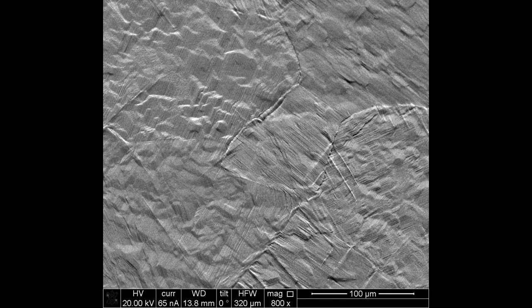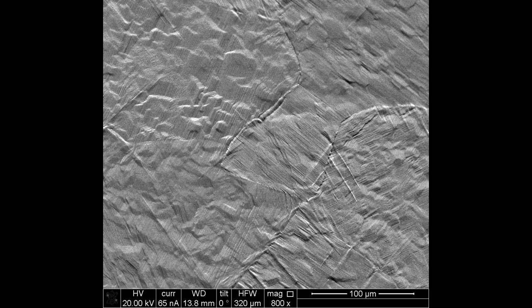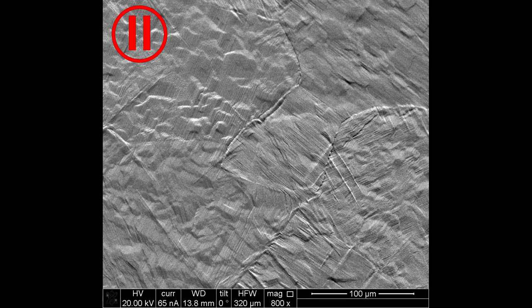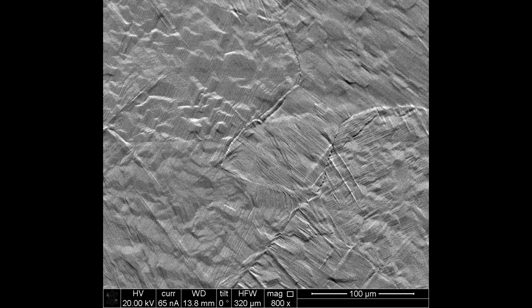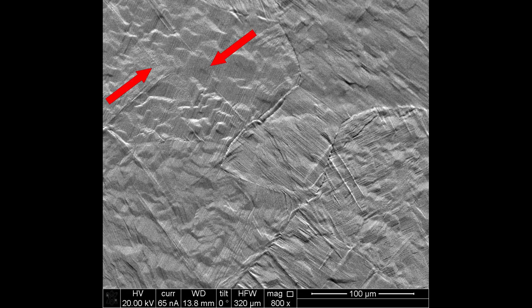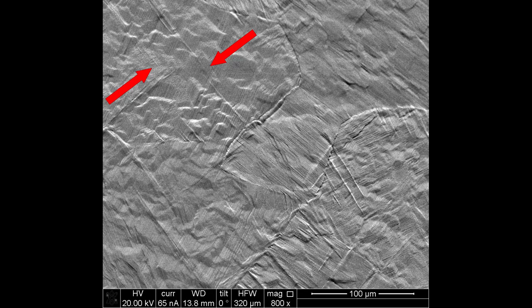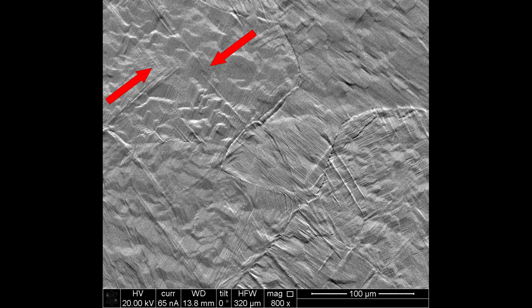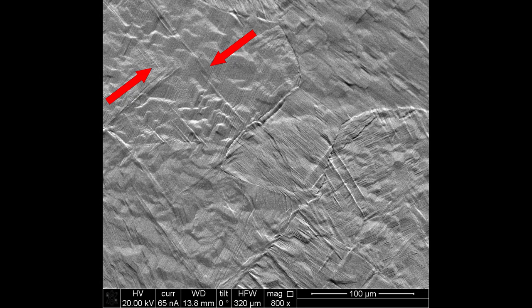At this point the alpha nucleation of lamellae is widespread across the entire sample. Some individual lamellae are seen to branch outwards to produce a fan of single variant orientations, which can then form a new colony. In the top left hand grain at this point you can see widely spaced laths impinge on one another from opposite sides of the grain. These widely spaced laths are skeletons for future single variant alpha colonies.